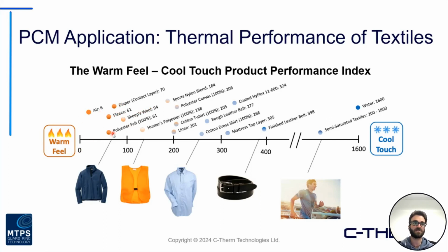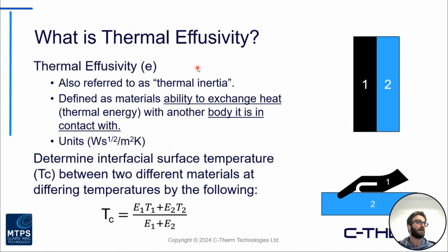These are materials often used in fall and winter wear, where you want to feel warmer, cozier, combating the cold temperatures and maybe even snow, depending on where you're living. But of course, if you're looking to develop activewear, things that athletes or trainers are going to be using, you don't want to overheat, so you want more of a cool touch sensation. Really, the perception behind that can also be important. So this is where the effusivity characterization can come into play.